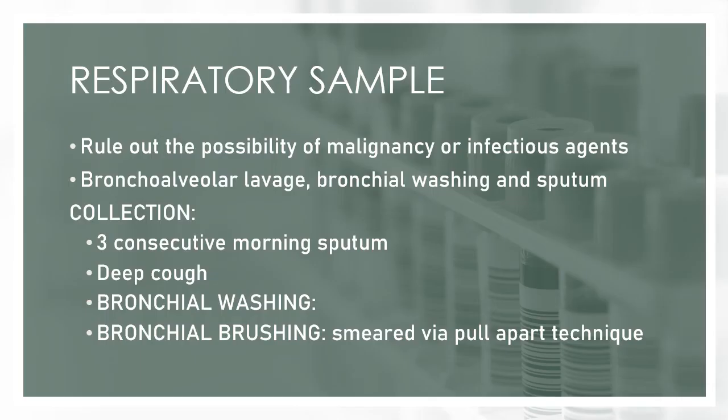Then you have your respiratory sample. This one is used to rule out the possibility of malignancy or infectious agents. Accordingly, your respiratory sample is usually requested for patients with immunodeficiency diseases, to rule out malignancy or the common infectious agents that infect your lungs.